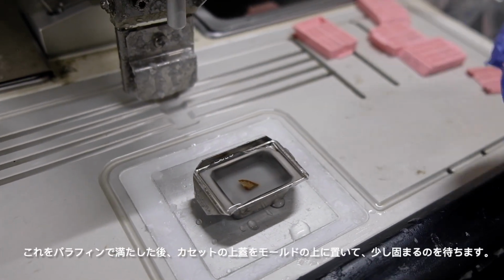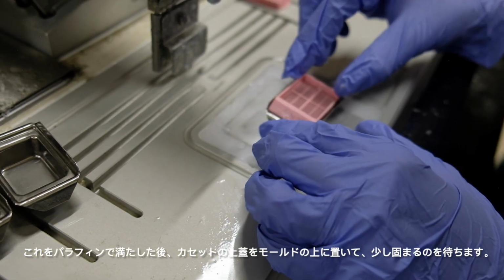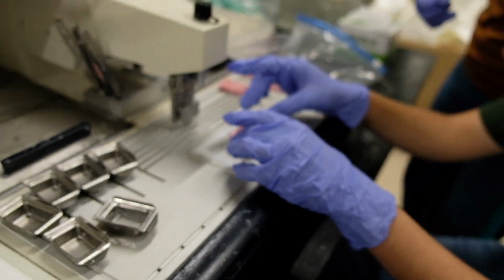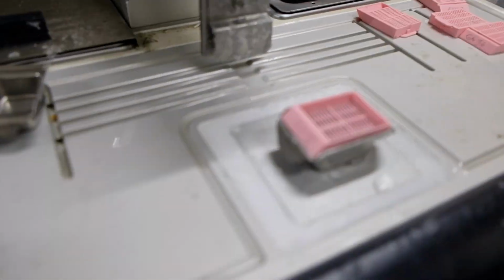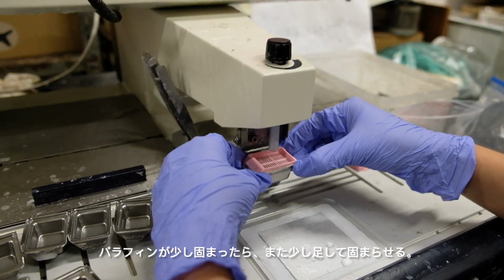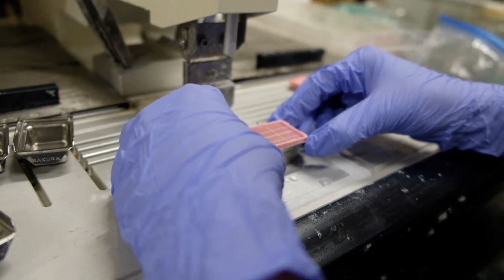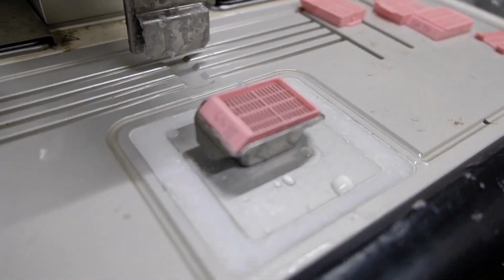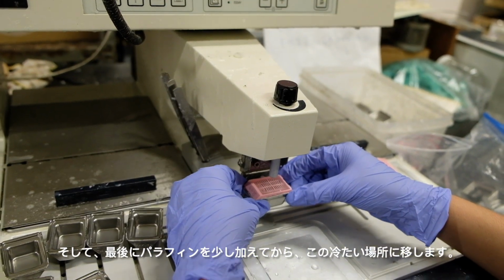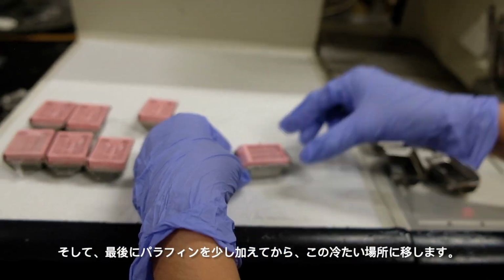After filling this with paraffin, we will put the top of the cassette back on and wait for it to solidify slightly. Once the paraffin is solidified slightly, we'll add a little bit more again on top of that cassette lid. Then let it cool a little bit again on this small cooling pad. And then add a little tiny bit more paraffin in the end, and transfer the whole thing over to this cool area.